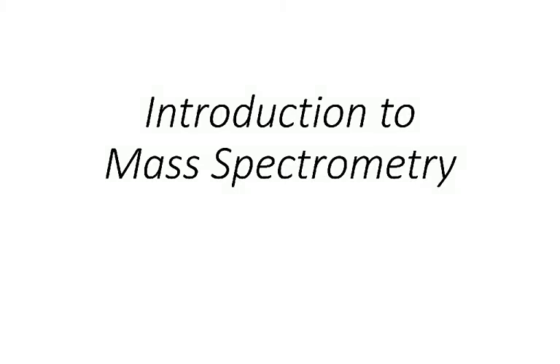This is the first of two videos on mass spectrometry. Much like I did for IR, this first video is more of an introduction, kind of goes into the theory, and then the second video is going to be more specific examples.